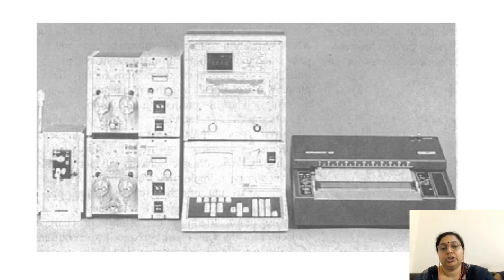In the picture, you can see an HPLC instrument. This is an old instrument. So you can see a readout system here, a chart recorder. Nowadays it is replaced by a PC.